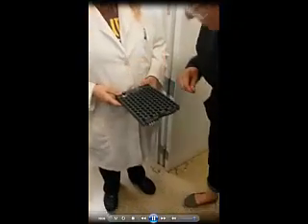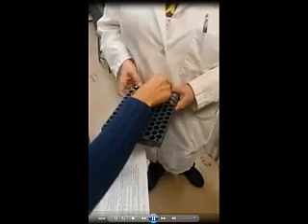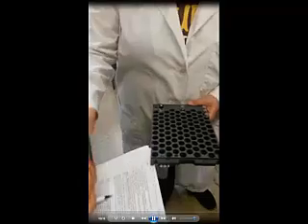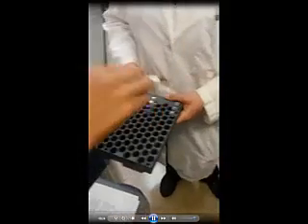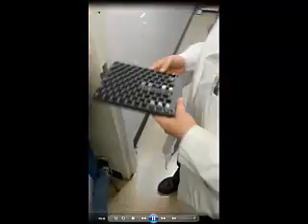Any way you want. Just remember what your number is. 41. Where's your lid? Right here. Make sure the lid is on. Yours is going to be different. Tighten it. Where do you want it? Anywhere you want. You're 42, so write that down. Numbers 43, 44, 45. All right. There we go.